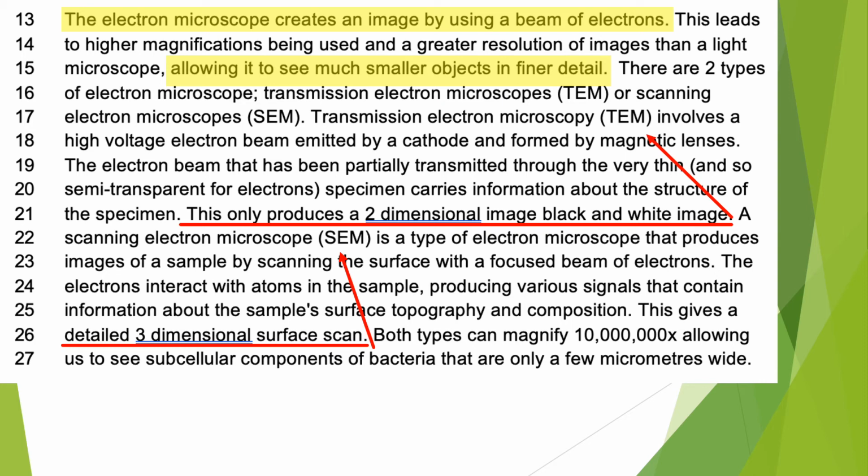So imagine same thing, an apple that isn't cut. You know there's a seed in there, but you don't actually know it until you open it up. Okay. But from a surface point of view, you can see that it's an apple. Okay, and most of the time, the SEM can produce a color image, but most of these are actually because the scientists, after they take the image, will add in the color to help differentiate what's what in the picture.